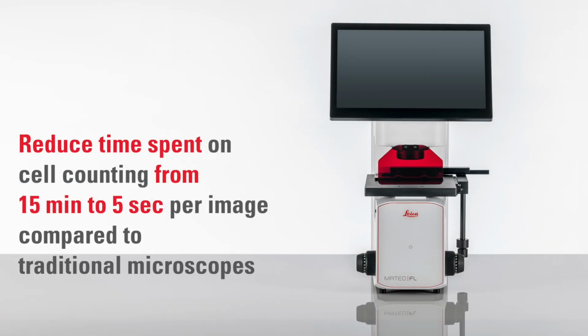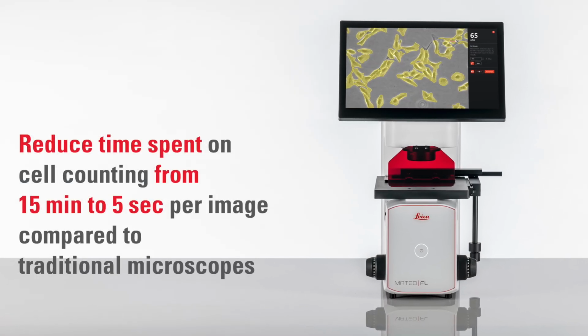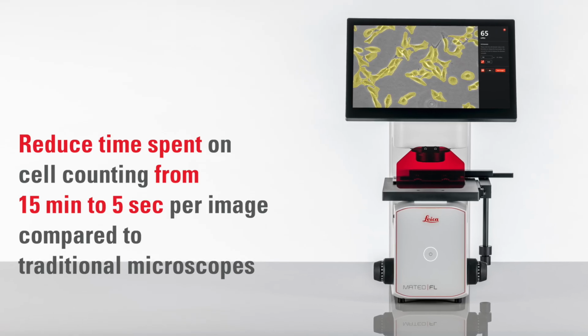Obtain a swift and accurate cell count with just a few clicks on your Mateo FL and forget about tedious manual counting.